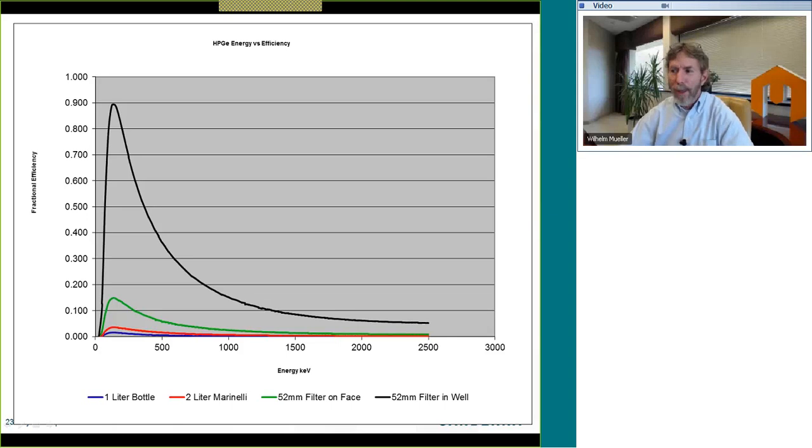I suggest to you that if we had tools like this that worked this well, not only for efficiency but resolution, that the Kahn method would have found a lot more homes than it did over the last approximately 20 years since it's been around.